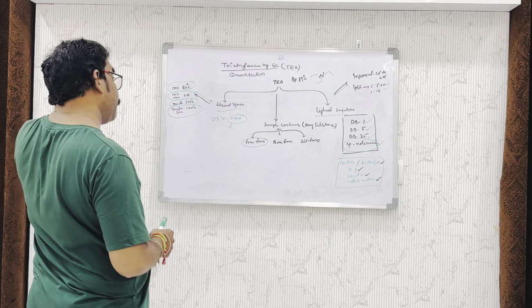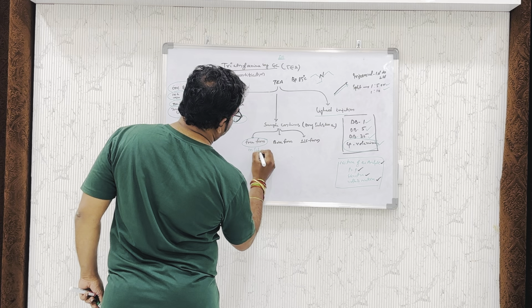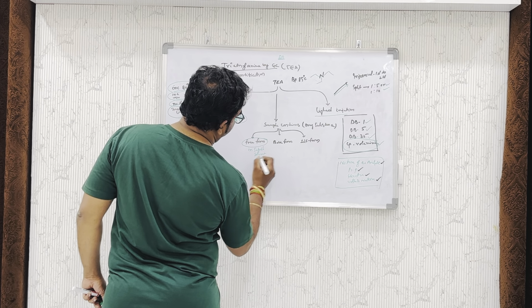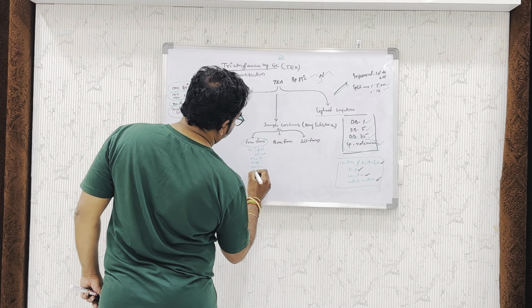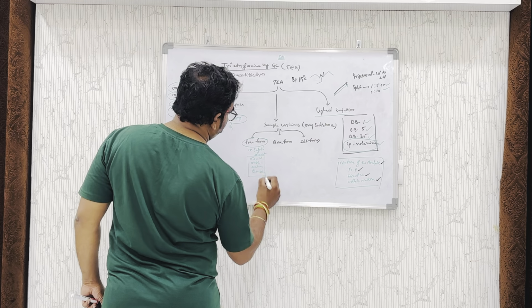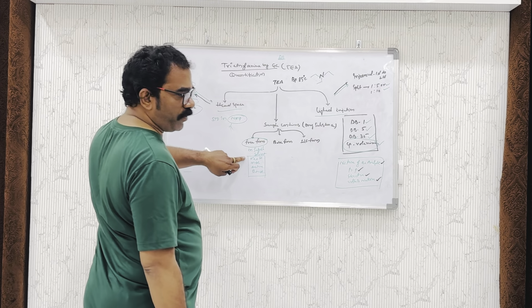By liquid injection, the sample is simply dissolved in a suitable solvent like methanol, MDC, acetone or ethyl acetate. Whichever solvent is suitable for your drug substance, that is very important. Then solubility is also very important.